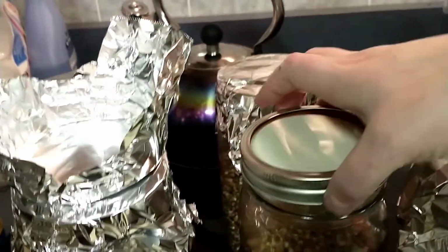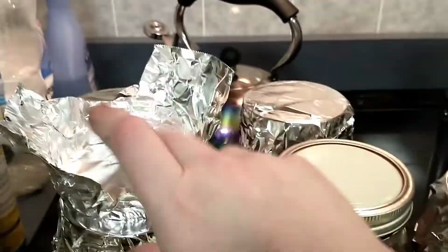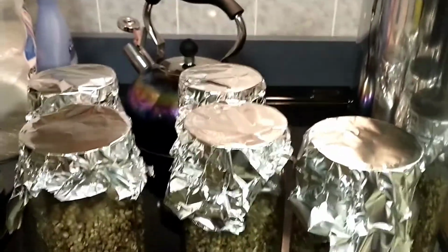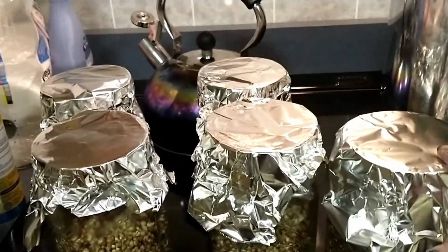You screw it on till it's finger tight so that it can breathe and your jar doesn't explode. And then you can just put your aluminum foil back on top here. And the aluminum foil is to keep water from dripping down into your jars. On my modified jars, it's more important because it's got micropore tape to cover up the breathing hole on there.